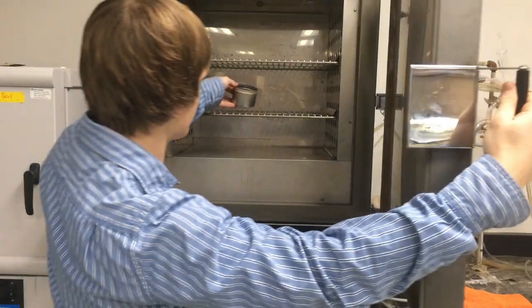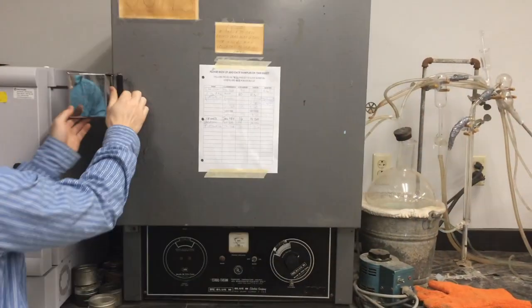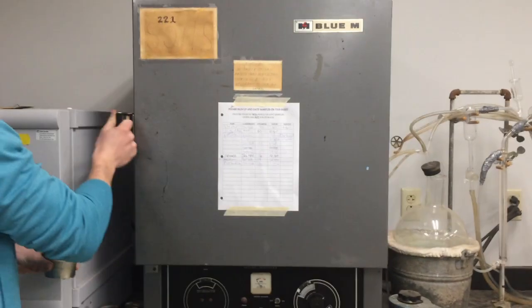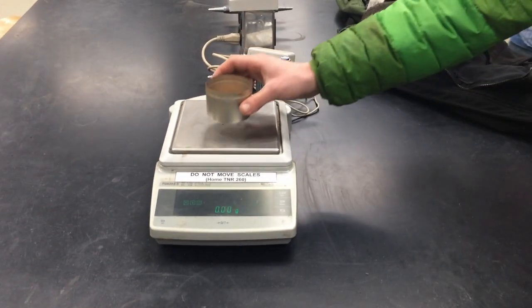Place the tin in a 105 degree oven for 24 hours in order to dry the soil. After drying, weigh the tin and record the mass.